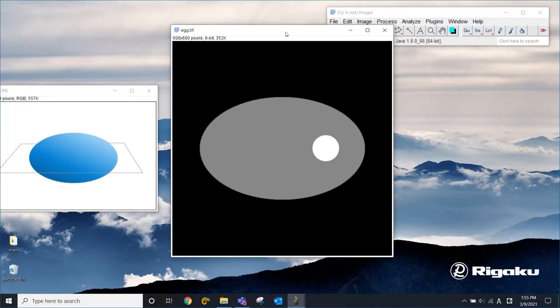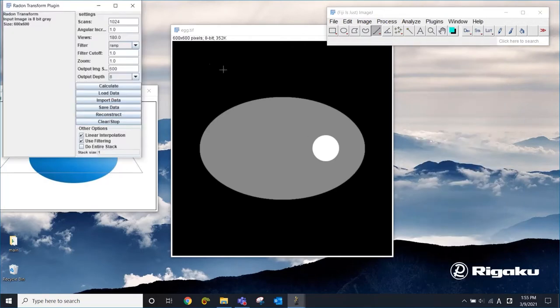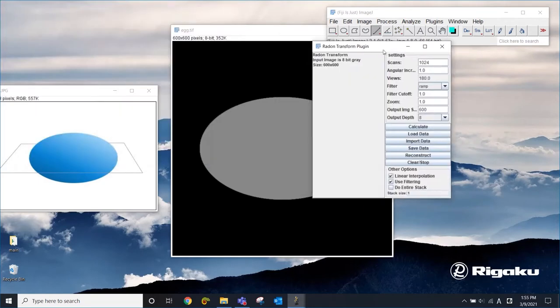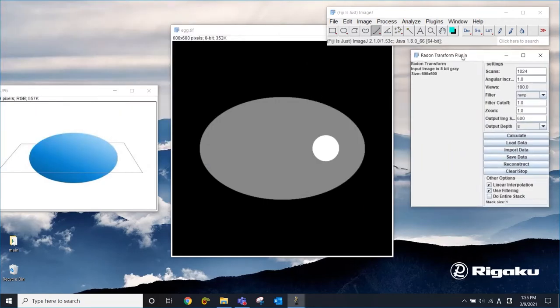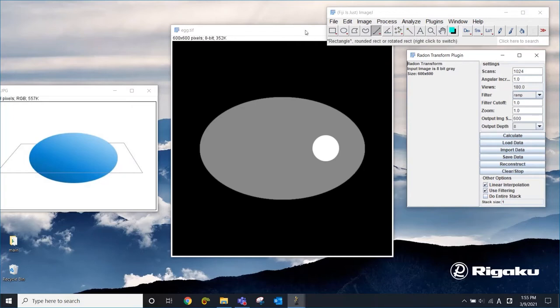To do that, I'm going to go to plugins and then go to Radon Transform. This is an ImageJ plugin and I'm going to put a link in my post so that you can download this plugin and do the same thing. Radon Transform is going to help you simulate the x-ray projections.